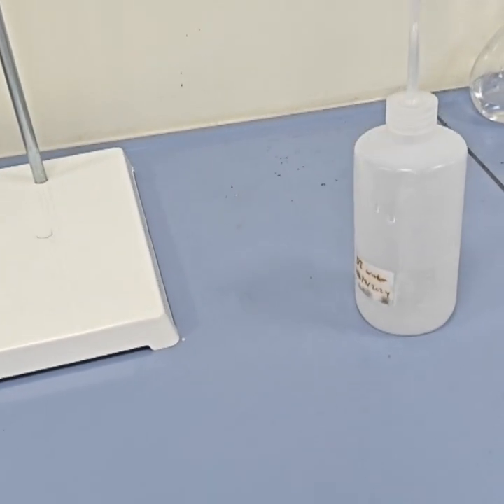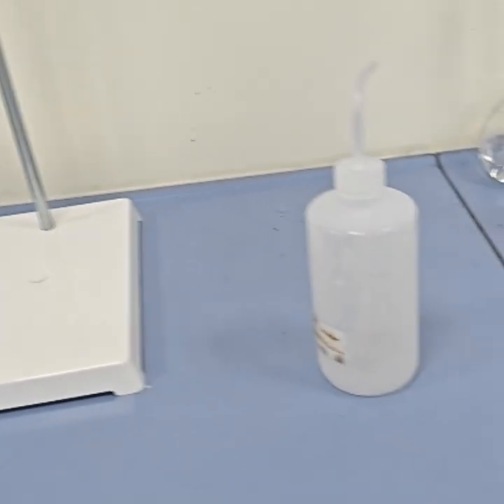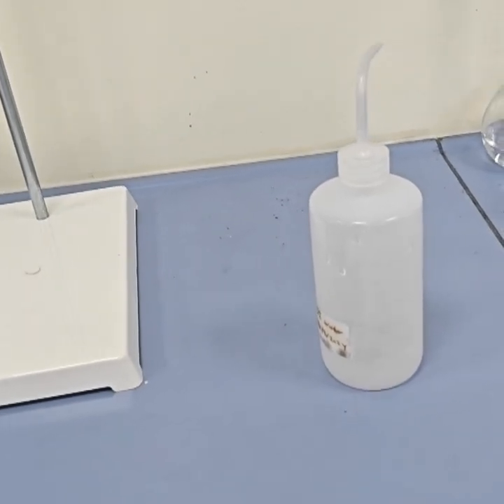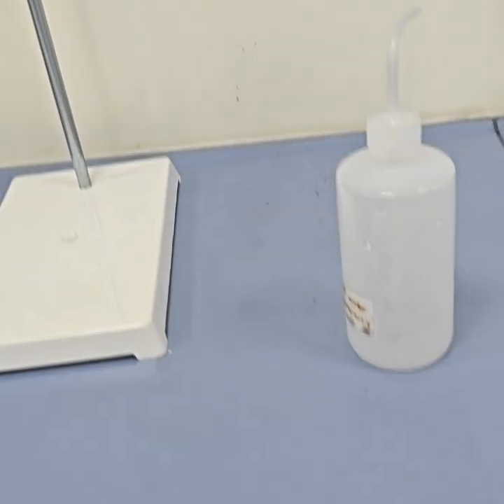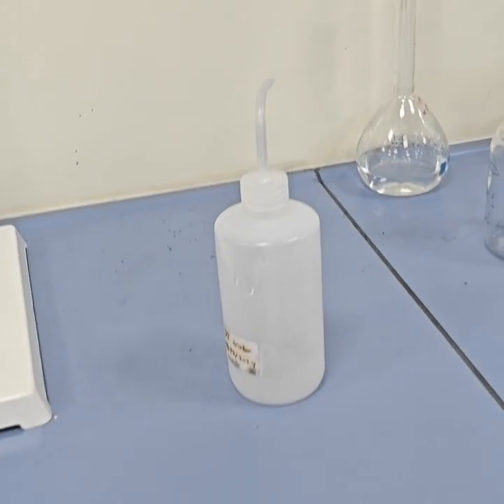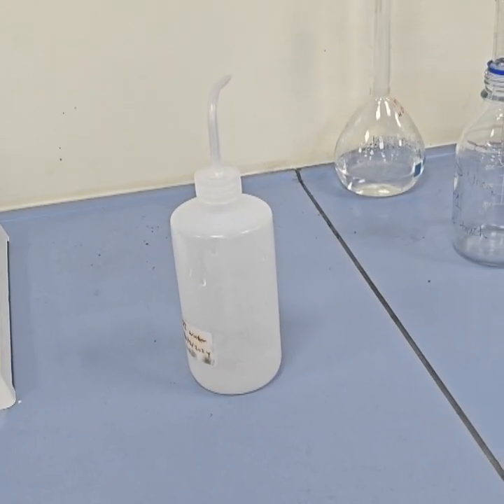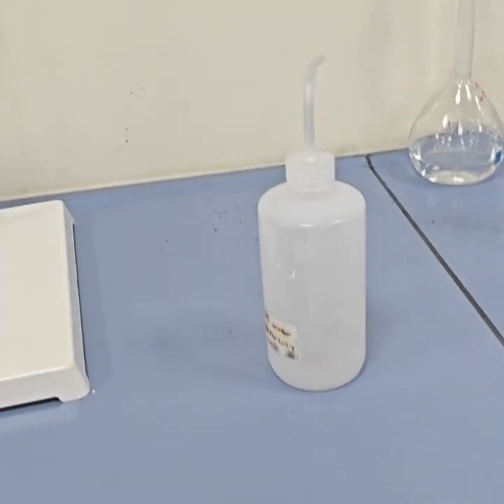Okay. Now for BOD and DO, do not homogenize. The sample must represent the natural condition to preserve the microbial community. For COD, nutrients or metals, mix gently before aliquoting to ensure uniform suspension without aeration. For organics, phenols and VOCs, do not shake or aerate. Avoid volatilization losses.